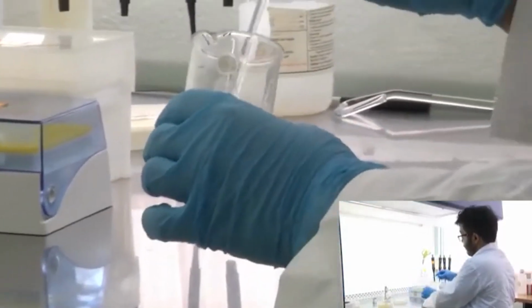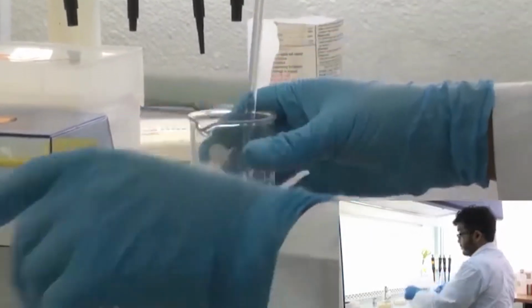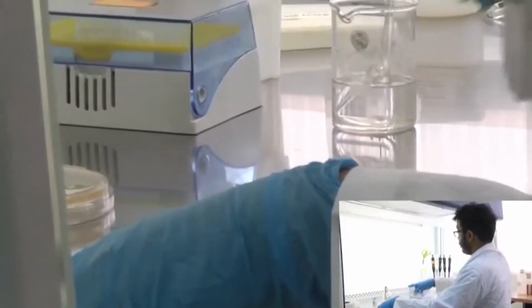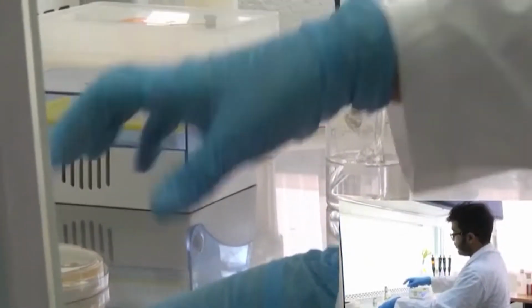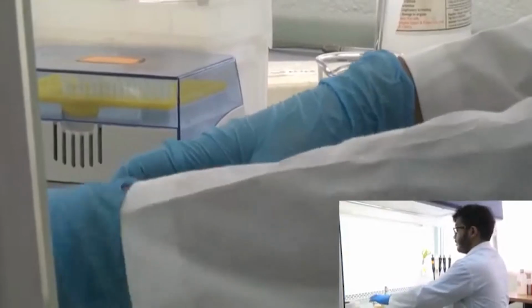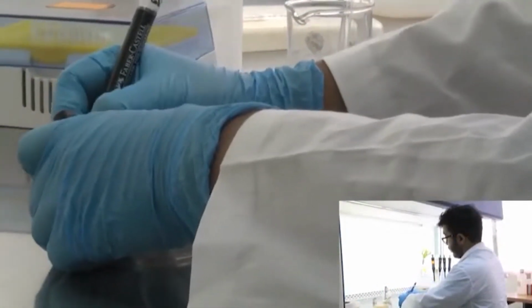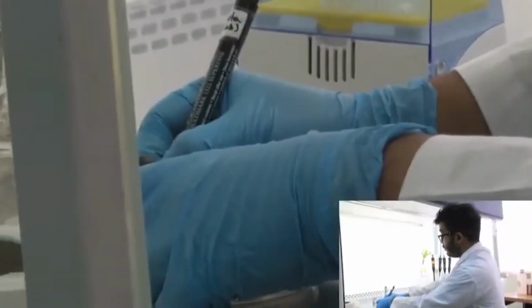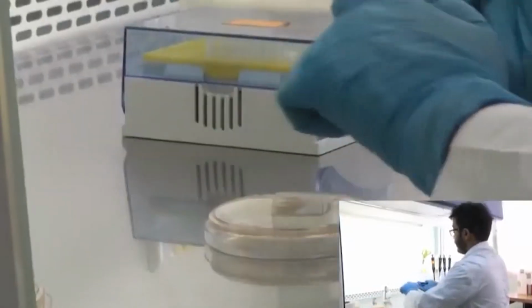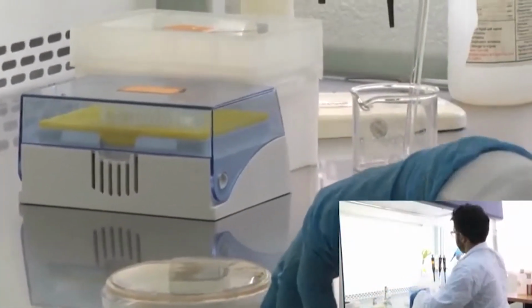I'm going to repeat the process again so that you can see it one more time. I'm dipping it in ethanol and heating it in the burner to evaporate the ethanol and dry it out completely, cool it for some time, and then use it to spread the culture. First I am going to spread 200 microliters of culture. Keep in mind that all this information should be labeled on your Petri plate, because unless it's properly labeled, you are going to be making mistakes in the subsequent steps.